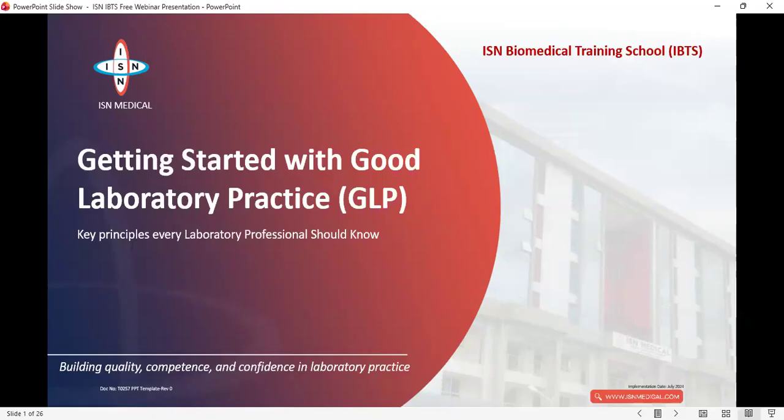Okay. Yes, it can. And why I'm saying yes is because a result can be technically correct and still be wrong at the same time, because the machine used in running the tests works properly at the time. The reagents are working fine.